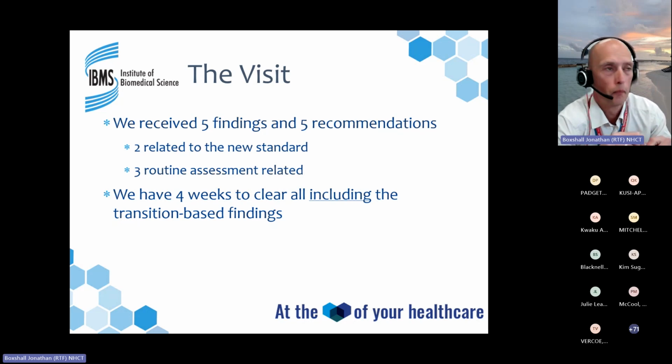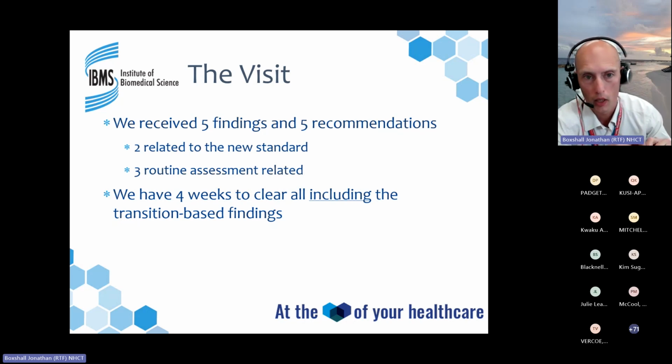So if, for example, in haematology, we'd done an audit on the full blood count process every year for 4 years, and we didn't really find anything. However, we had a problem with the SOP. Every time they reviewed it, they weren't updating the paper copy, so the version number was wrong.